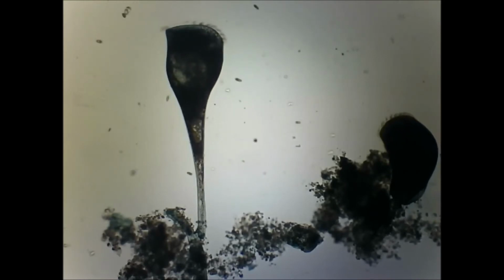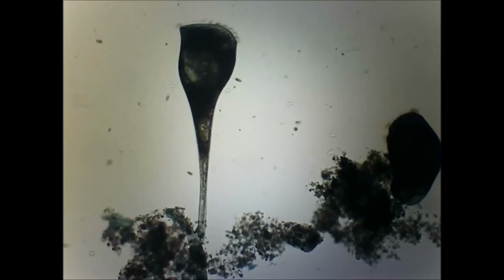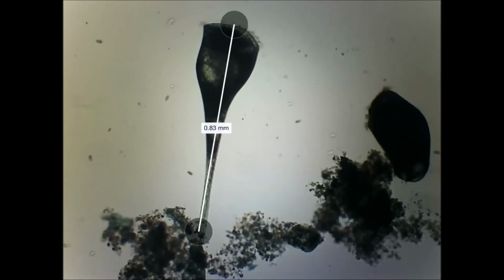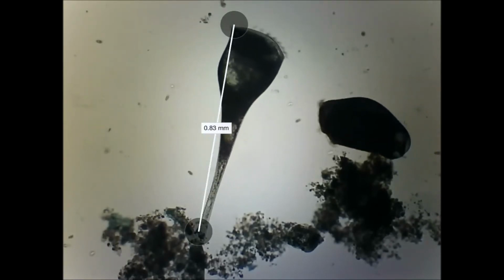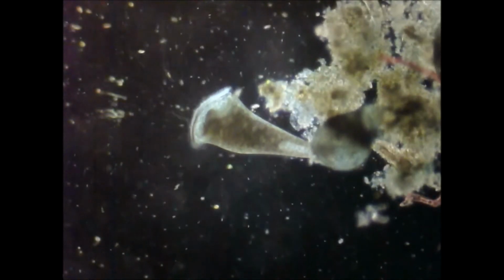It's a ciliate because you can see the cilia beating around the top of the Stentor over there on the left. And over on the right, you could see another Stentor not taking that trumpet shape because it's free swimming and so tends to form more of a barrel shape. This one is a little bit more than 0.8 of a millimeter in size, just on the edge of being visible.